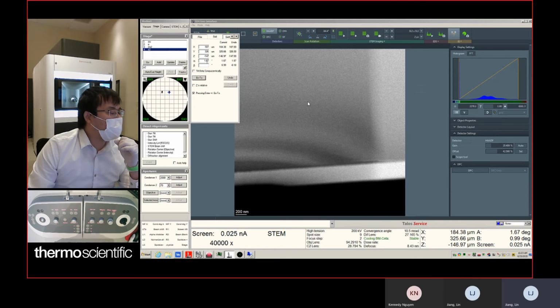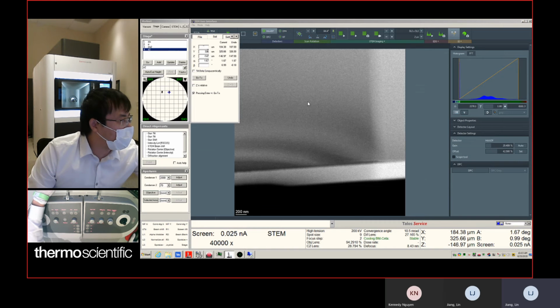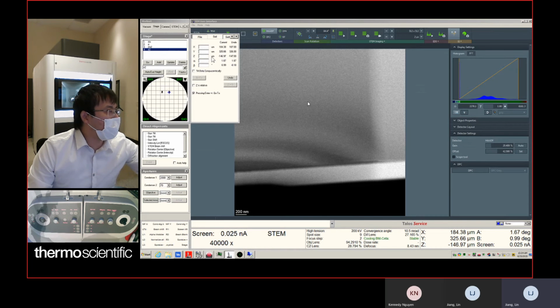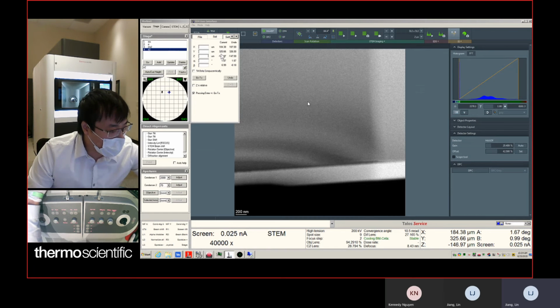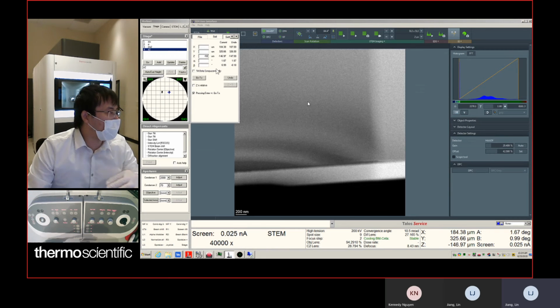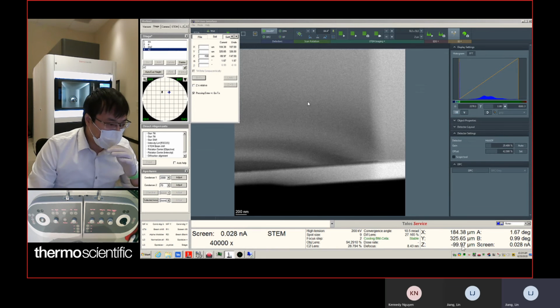It's useful because usually, if you move the rest of the values, you can set only one value. Like if I want to keep the rest of the values the same, but I want to move Z to 100 micron here or negative 100 micron, you can just type a value here and say go to. It's going to only move Z to minus 100.